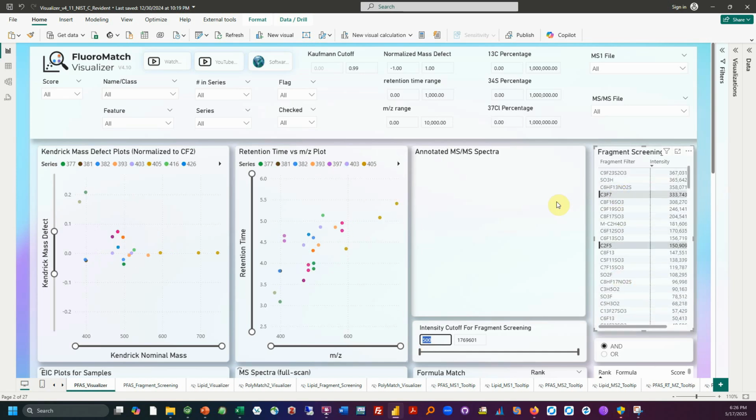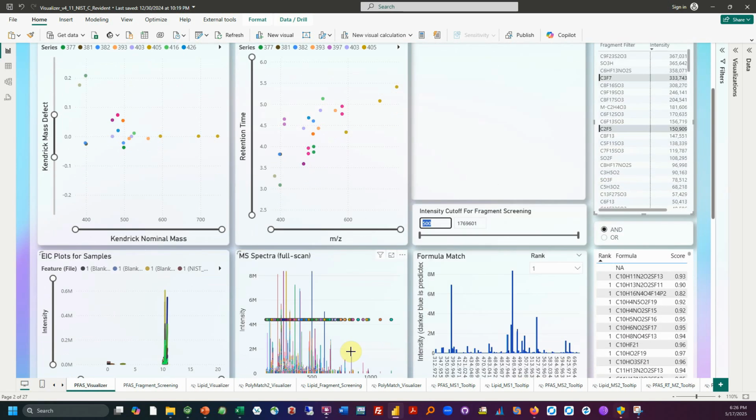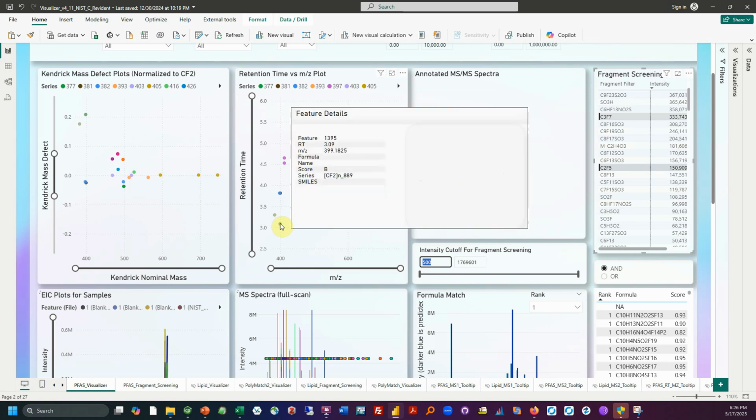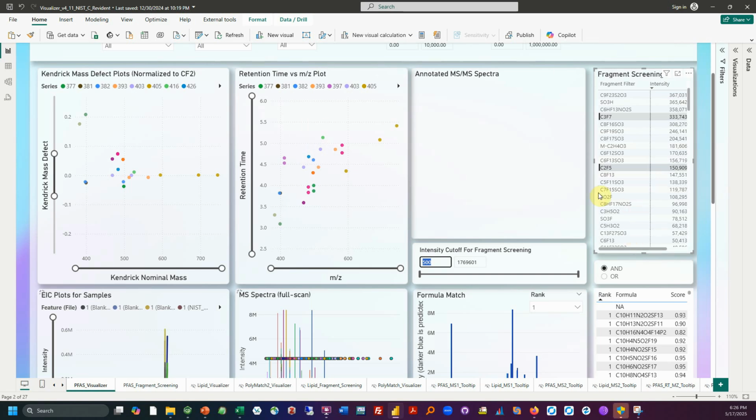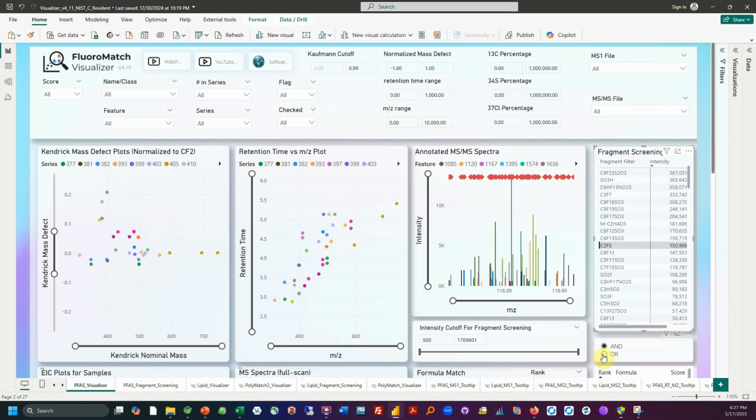They have 2 carbon-fluorine related chains. Very unlikely to happen by chance, unless again there's a mixed MS1 spectra. Always check for that. And then we can come up with another unknown compound, such as this 889. Again, pull out its series, look at its MSMS, try to identify it. Alright, so we did homologous series for complete unknowns, clicking certain numbers of homologous series. We did fragment screening. Now, I'll unselect these, of course, right? Always unselect the AND again after fragment screening.